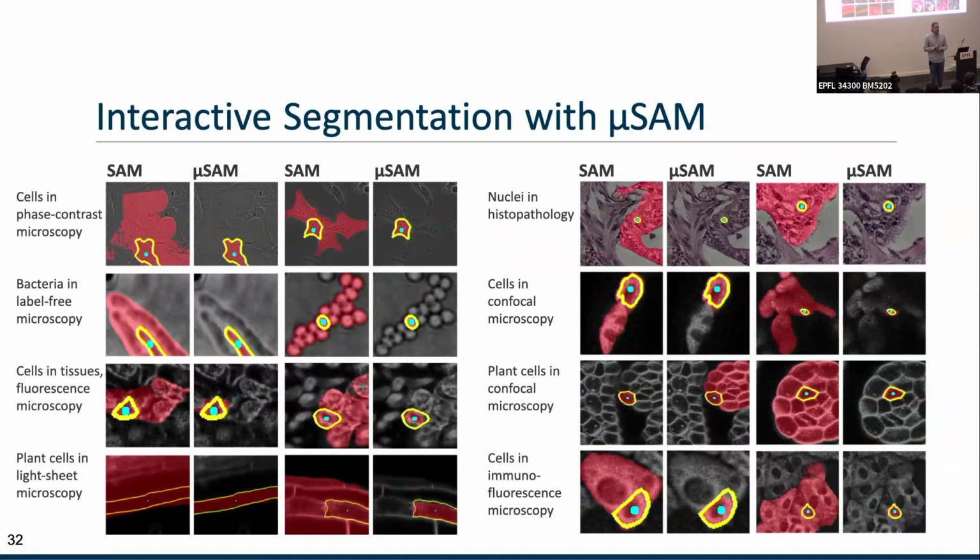To follow up on this question, in the 3D case, have you tried to merge your microsam 2, which is 3D, with the convolution that you have? This is what is already in there. The segmentation part is already a CNN, so it does some of this refining, but the problem is that it starts out from a lower resolution. One could do another step, with another network that works on these masks and tries to refine them. We haven't done this, but there is quite some work where people train these refining style models.